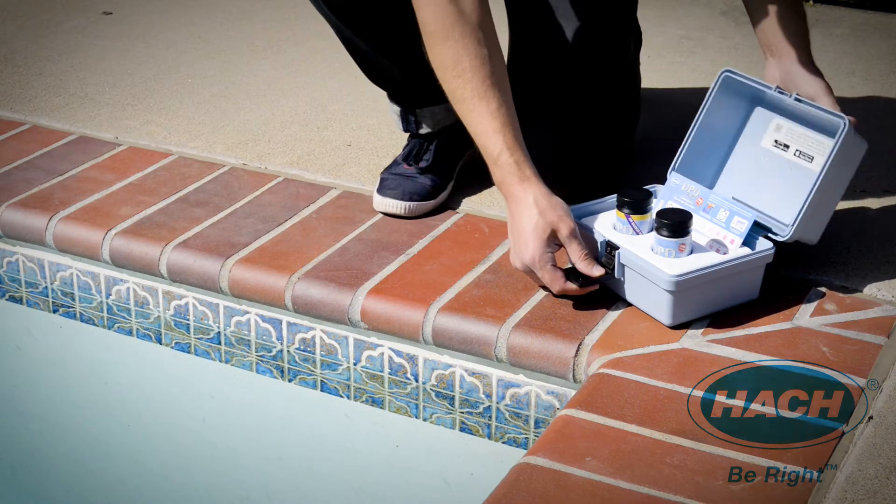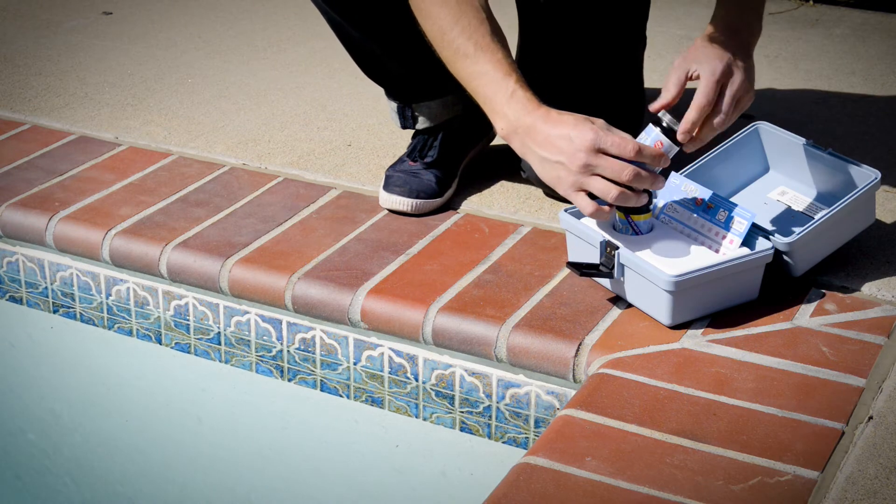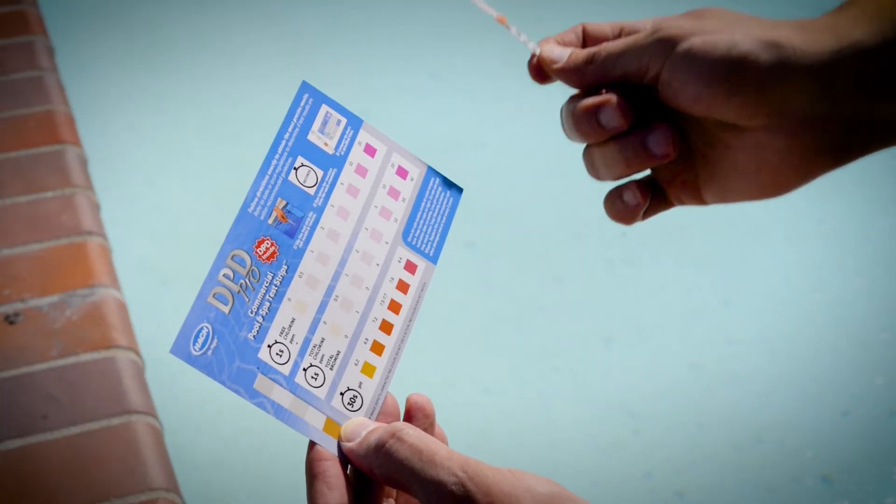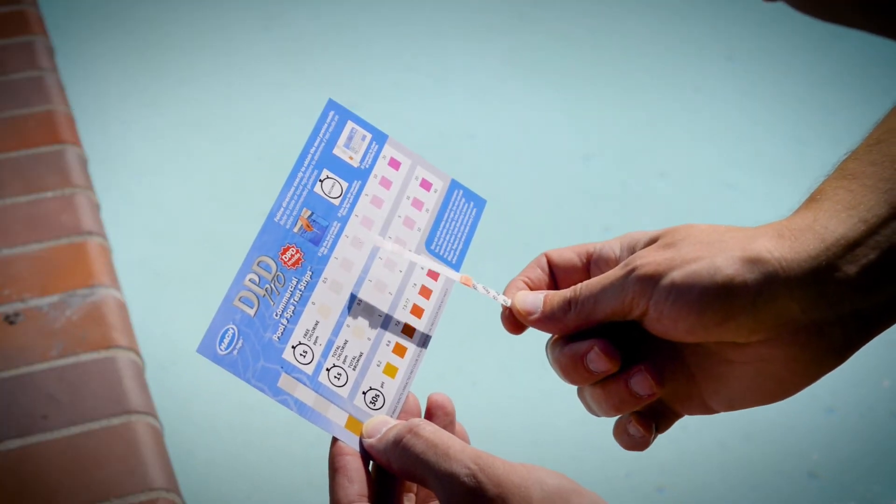DPD Pro test strips conveniently allow you to test these parameters in a single strip. Simply dip the test strip directly in the pool or spa, just deep enough to get all the pads wet, and remove. Read free chlorine and total chlorine results immediately by comparing the test strip to the color card.